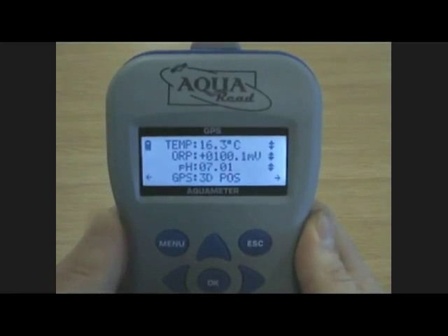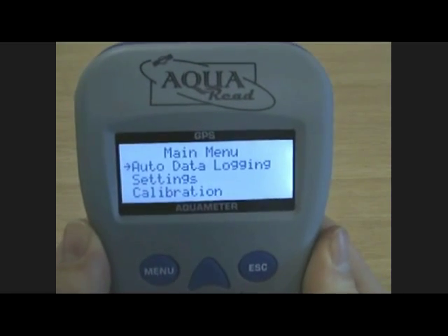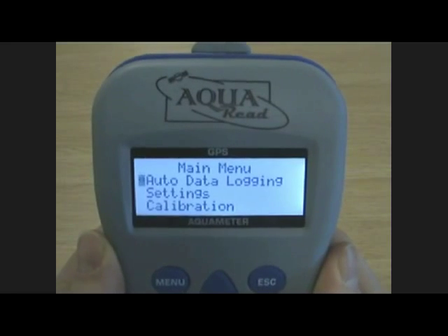Let's go through the menu. By pressing menu, you're presented with these three options: auto data logging, settings and calibration.